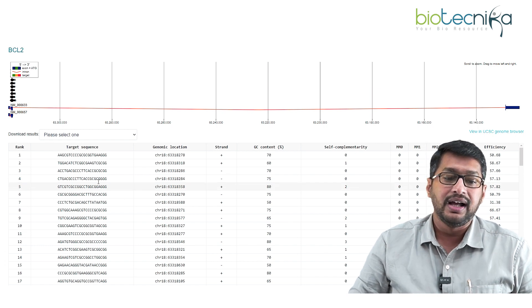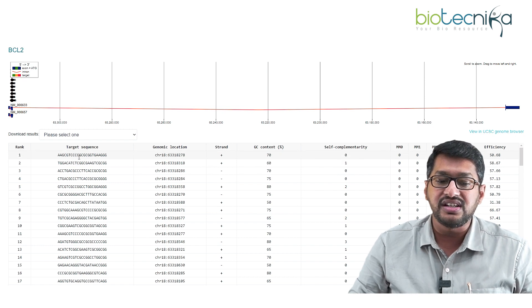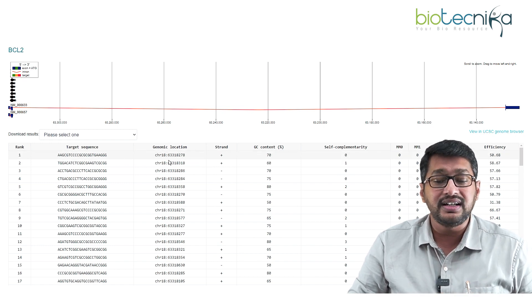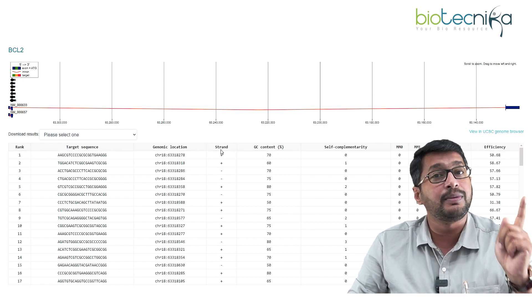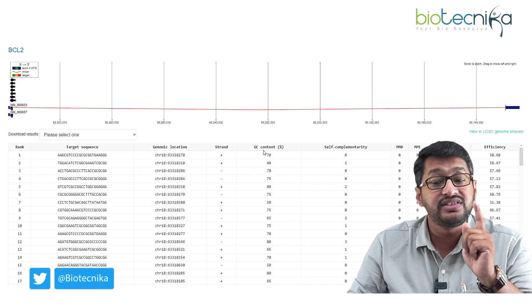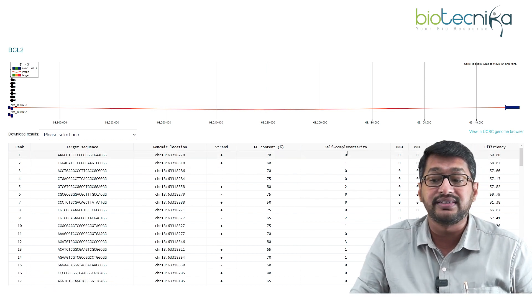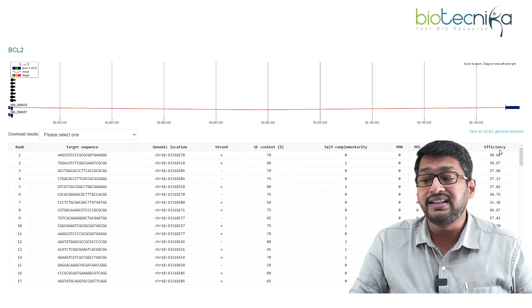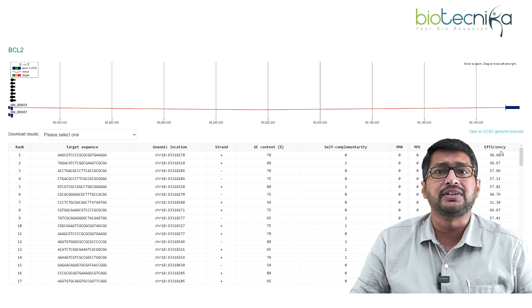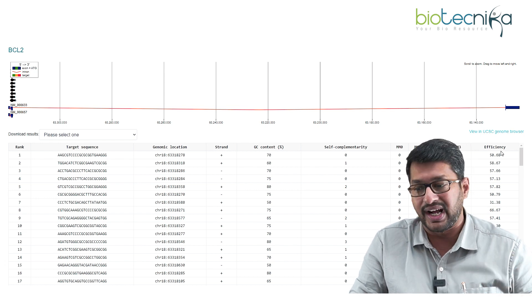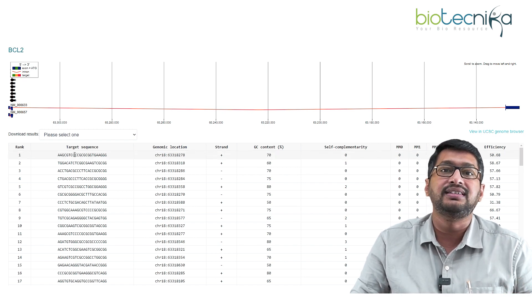The tool now gives me the 17 best-ranked results for the BCL2 target gene. For the top result, the target sequence is shown (e.g., AAAGCGC...), along with the genome location, whether it is on the plus or negative strand, the GC content, self-complementarity (which is zero — great news), and an efficiency score of around 50%.